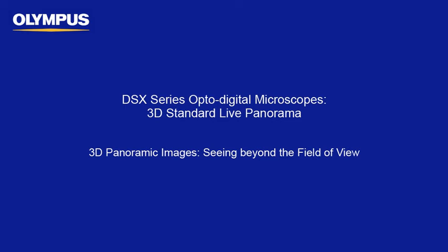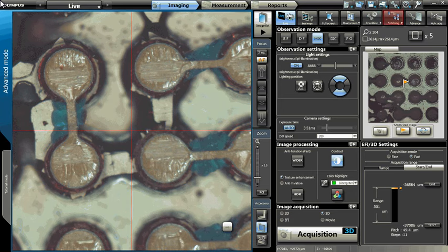This tutorial video will provide you with detailed instructions to acquire 3D standard panoramic images on the Olympus DSX series optodigital microscopes. To begin creating a panoramic image, we will select Stitching from the button bar.